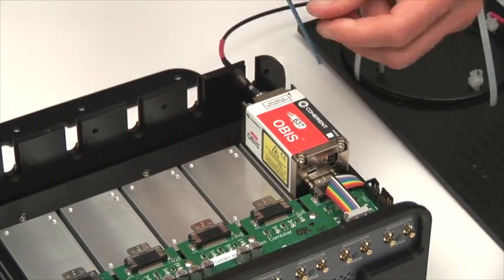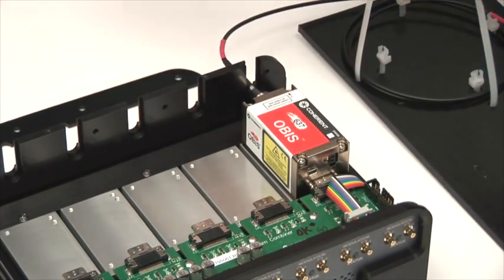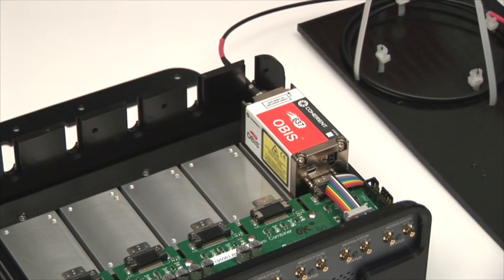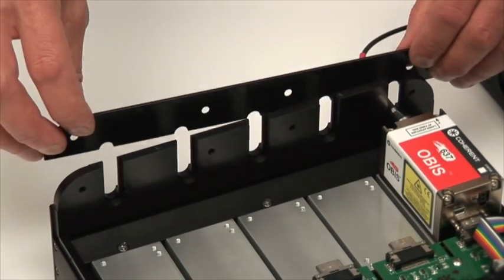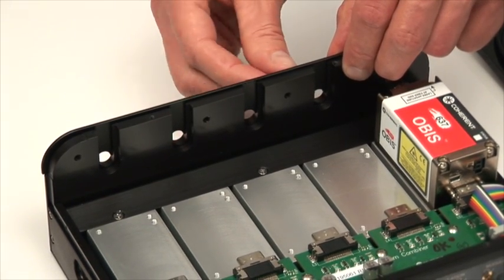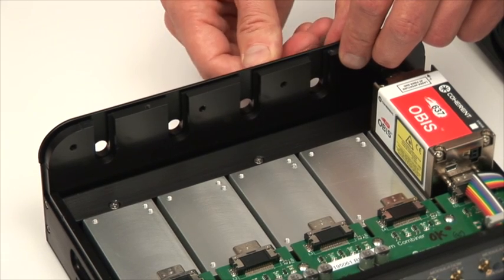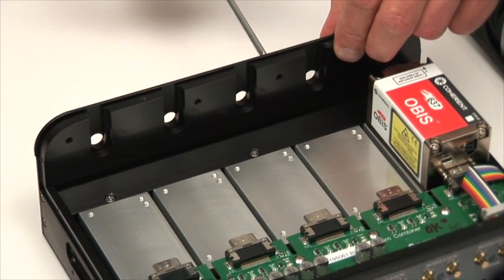OBIS lasers have very flat base plates and the OBIS laser box also has very flat heat sinks, so there's no need for any additional materials between the heat sink of the laser and the heat sink of the laser box. After the laser is installed, to complete the strain relief, the back plate can be installed to help capture the fiber as it exits the laser box. With that screwed in place, the fibers are protected.